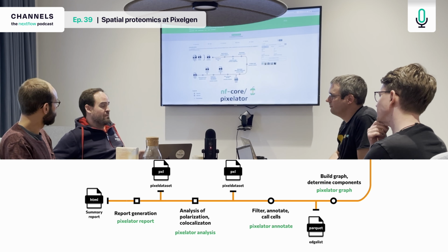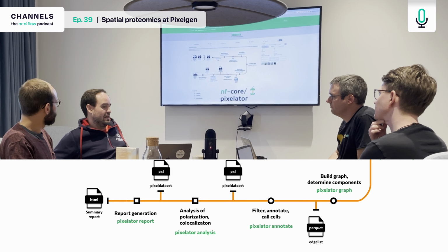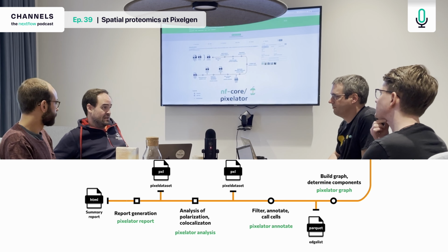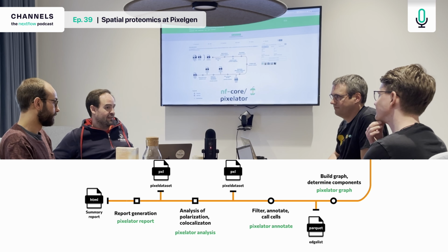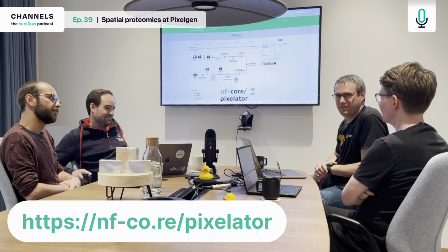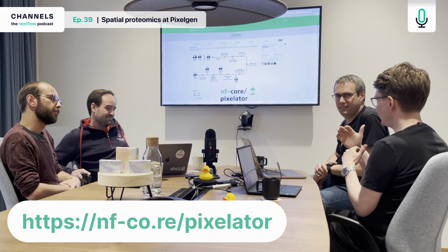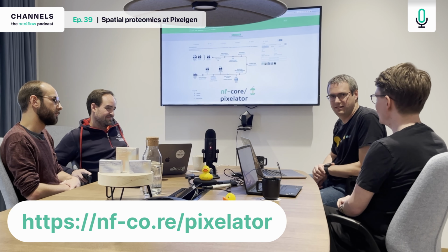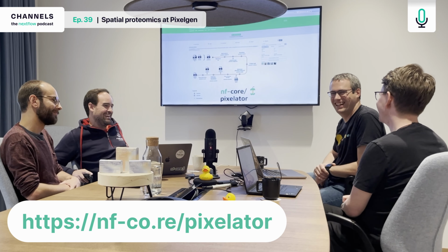And all the formats in the files that every step produces are also open formats. We don't have any private format. Actually, the pixel format that Johan invented is basically a zip file. Okay. We're just bringing a bunch of different data frames together into this pixel file, so it's easy to move around. You've been reading XKCD comics long enough to know.